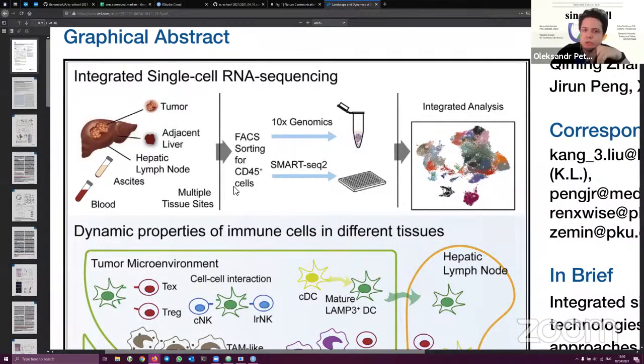And if you want to enrich your cell suspension specifically for immune cells, you would probably do this, and probably something else additionally, but they just separated their cells for CD45 plus and CD45 minus, and those cells which were CD45 plus, they then submitted for single-cell sequencing. So what I did for this workshop, I uploaded these data sets and made partly the same analysis we'll discuss today. Yes, it's very true. As Jan wrote in the chat, it's a pan-leukocyte marker, meaning that all the leukocytes will be in the sample.